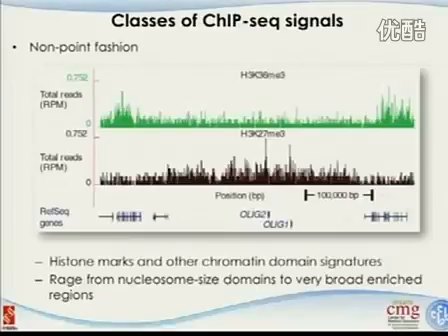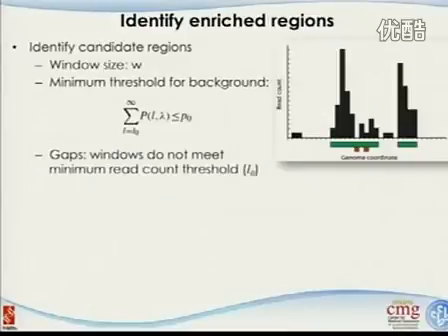All right. So computational methods for identifying chromatin signatures will be very brief because, as I mentioned, there are not many methodologies, at least that I can find. This is an earlier slide that shows the classes of ChIP-seq signals. This is actually the 3rd type. There are no peaks, and not a peak followed by transcripts. Rather, it's just a broader range that has an enriched signal compared to the background signals. And this is what we are trying to identify.